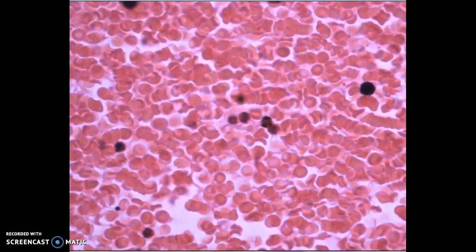For the blood lab, you are going to be looking at blood cells. When you look at a sample of blood, you see mostly erythrocytes, which are red blood cells. And you can see in this slide, they're biconcave discs, and that actually helps with the diffusion of oxygen. Now, the least common type of cell in blood is the white blood cell. So these are all white blood cells. These got stained with whatever stain the slide was, so they're not white.